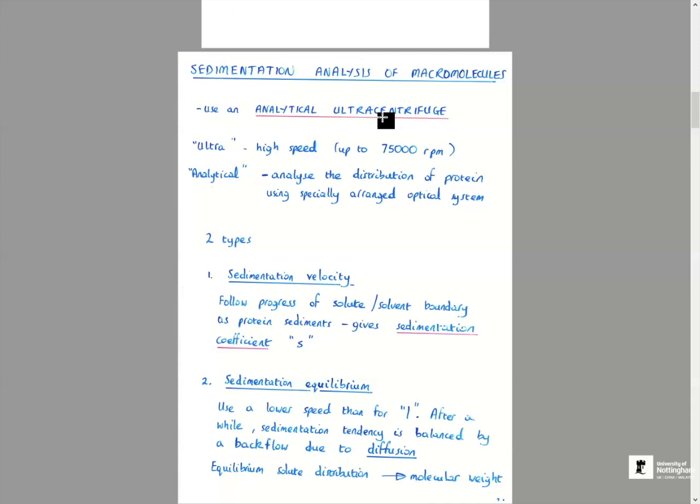I think everybody here has used a centrifuge at some stage in your practical careers for clearing cell debris out, or purifying a food solution from particulates and things. Who hasn't used a benchtop centrifuge before? Well, okay, we'll make sure that that is rectified.